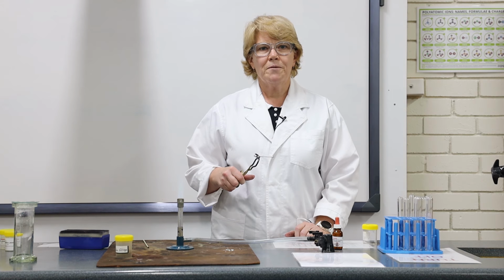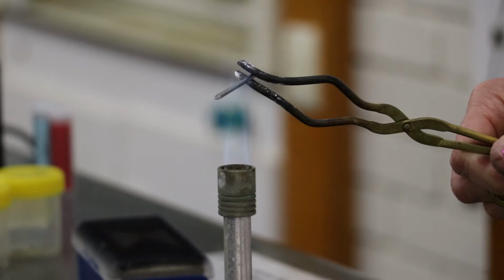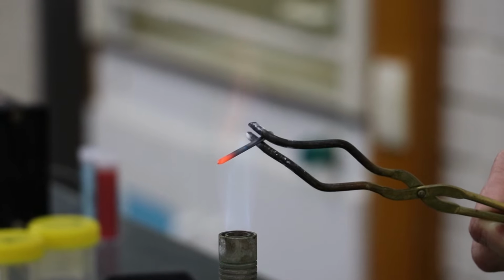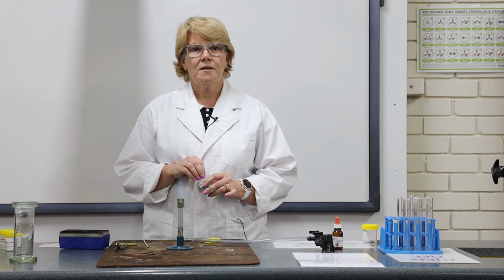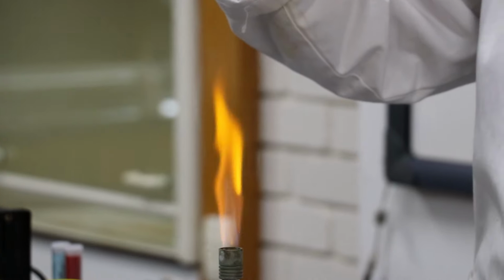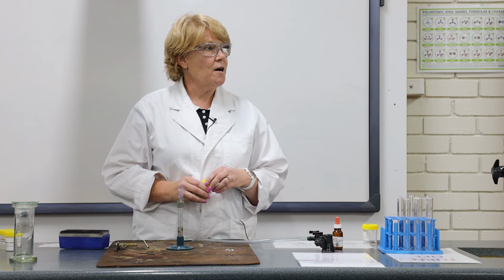Let's have a look at what happens when we put an iron nail into the Bunsen burner flame. Mostly, all that is happening here is that the nail is glowing red hot. Now I'm going to sprinkle iron filings into the Bunsen burner flame. By increasing the surface area of the iron, I should be increasing the rate of reaction. Oh, do you see the sparks? The iron will ignite much more readily when it has higher surface area.